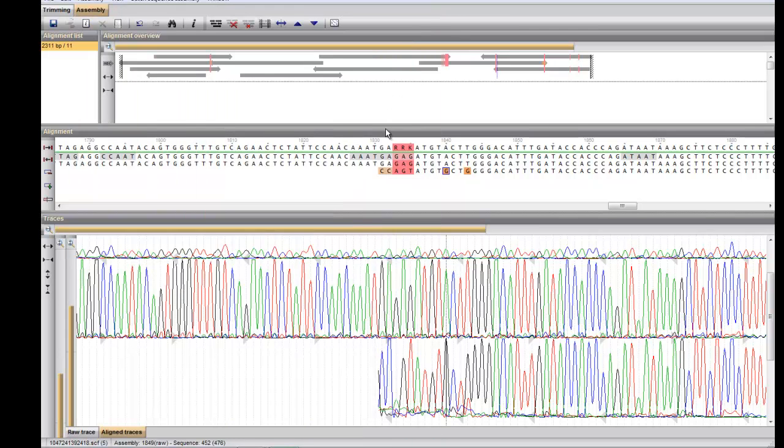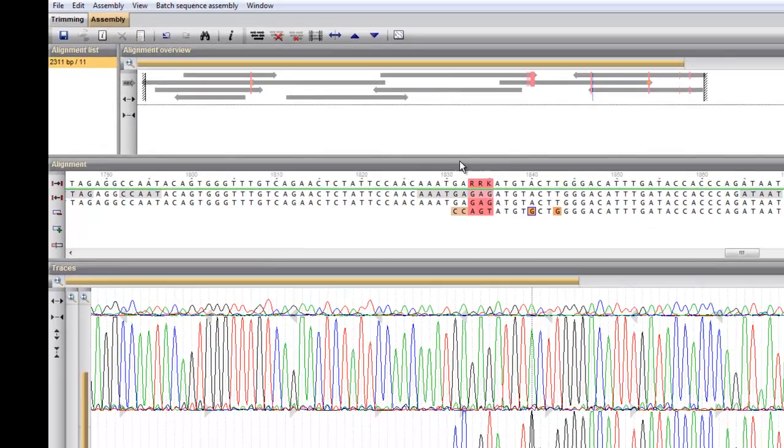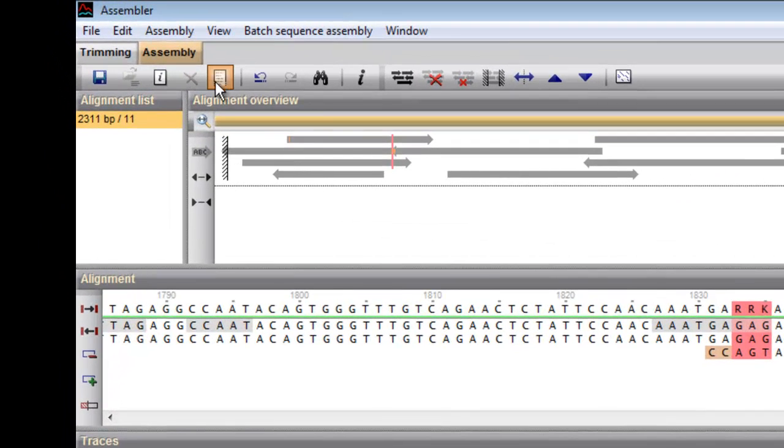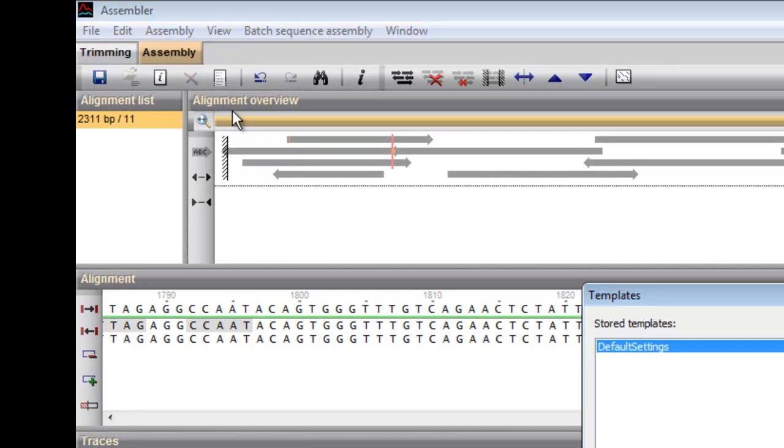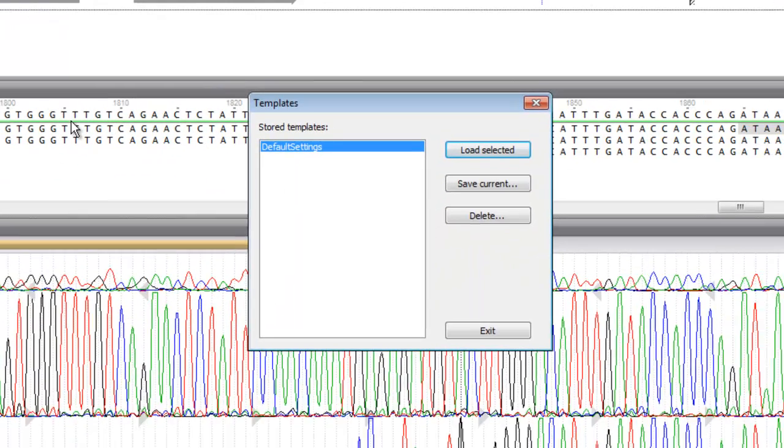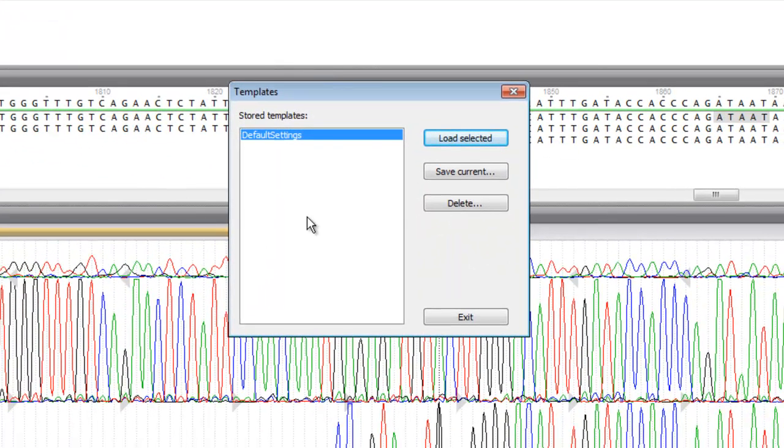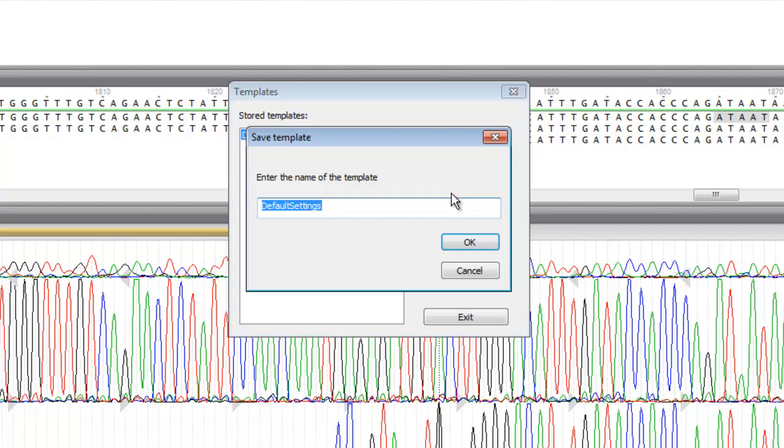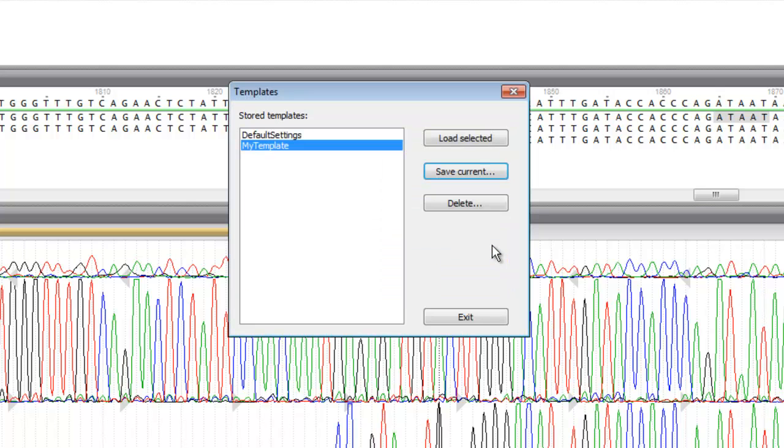The settings used in this project can be saved in a template for later use. Click the templates button and press save current. Here you can type a name for your template. It is now available to be loaded in a future project.